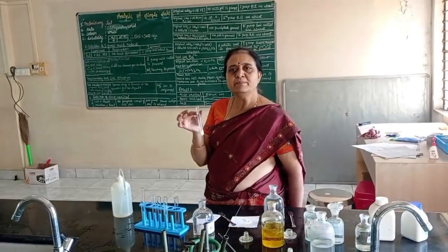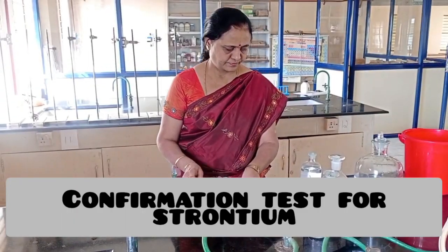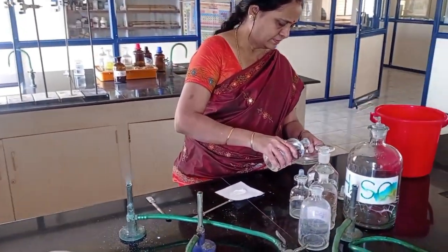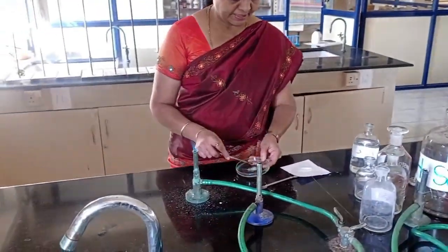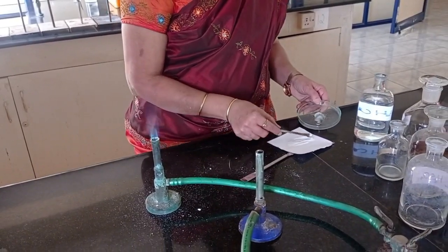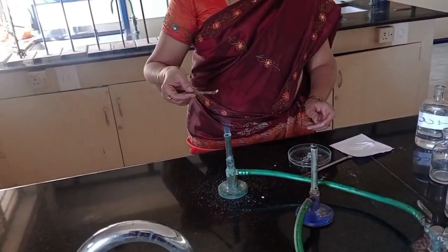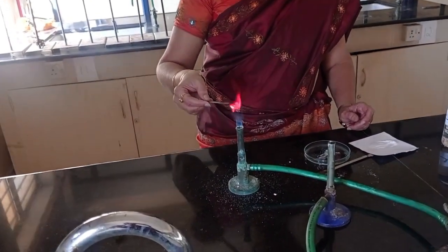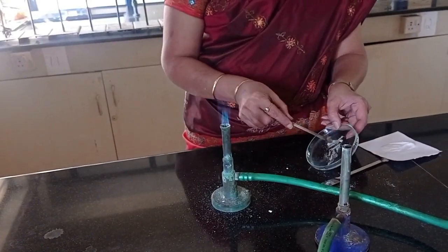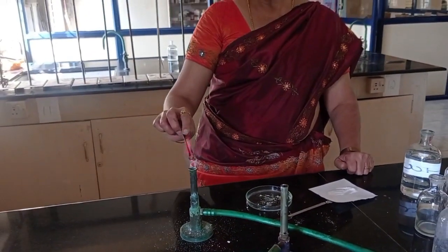Now I am doing confirmative test for strontium, that is flame test. I am making the paste of the salt with concentrated HCl, and I ignite the paste by using Bunsen burner. See the color. What is the color observed in Bunsen burner? I am getting crimson red. It confirms the presence of strontium.